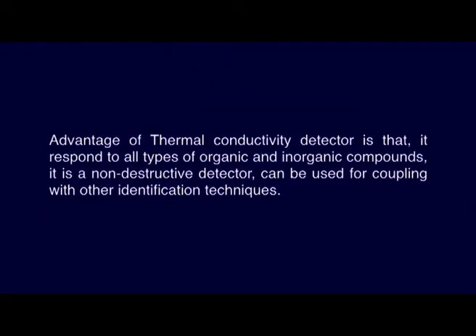The advantage of the TCD detector is that it responds to all types of organic and inorganic compounds. It is a non-destructive detector. So, whatever effluent comes out of the TCD detector, we can pass into another detector, and identify the components by coupling with other identification techniques. The detector is simple and inexpensive, but it is less sensitive, and biological samples cannot be analyzed using TCD detectors.